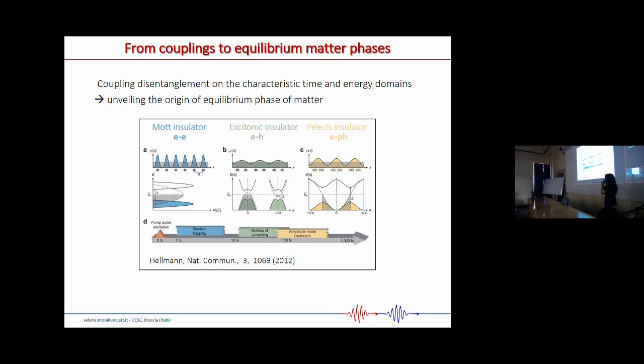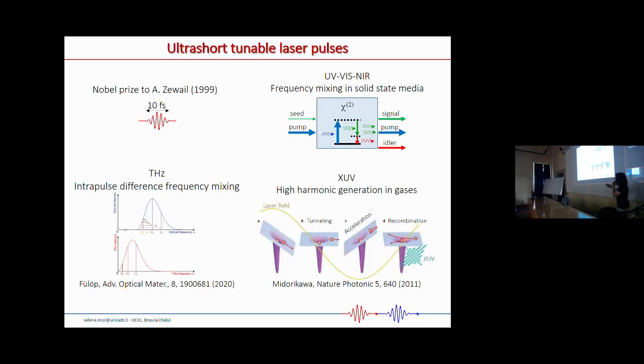So coupling disentanglement in the time and energy domain is also one of the typical approaches for performing time resolved measurements in coupled systems, or correlated systems particularly.